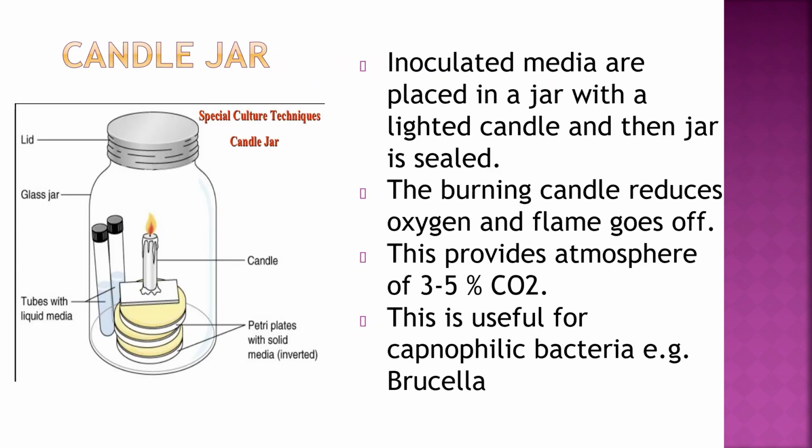The second method is candle jar. In this, inoculated media are placed in a jar with a lighted candle and the jar is sealed. The burning candle reduces oxygen and the flame goes off. This provides an atmosphere of 3 to 5% carbon dioxide, and this is useful for capnophilic bacteria.